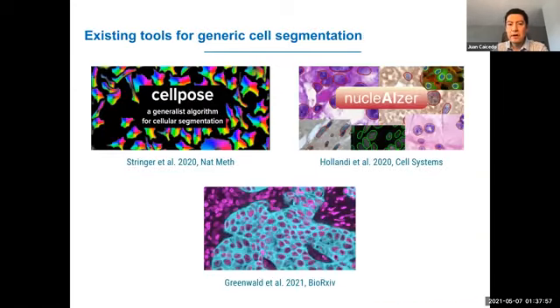So there are more recent works that have specialized in specific aspects of segmentation. And I think we are now reaching the goal of having a kind of universal segmentation tool for cells. There are at least 3 methods that you can find on the web: nucleizer, CellPose, and this one is called Mesmer, which was recently published, maybe last month or so. All of them are pre-trained models, and surprisingly, all of them kind of use strategies that people used in the competition as well. Mask R-CNN in the case of nucleizer, UNets in the case of CellPose, and feature pyramid networks in the case of Mesmer.